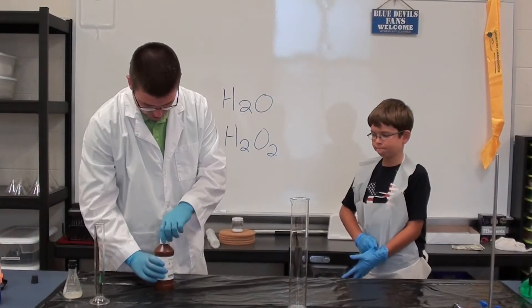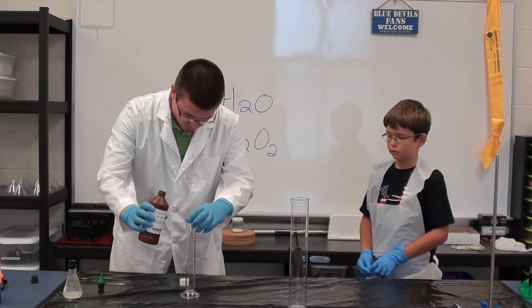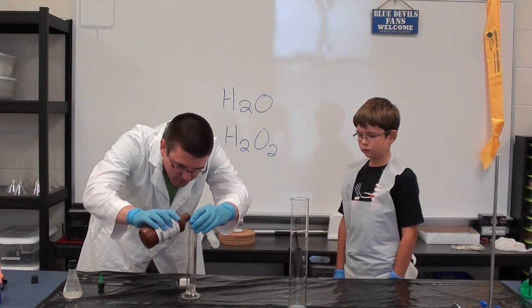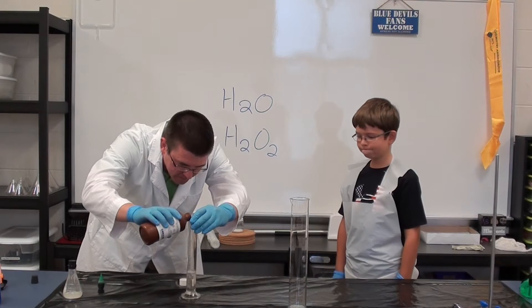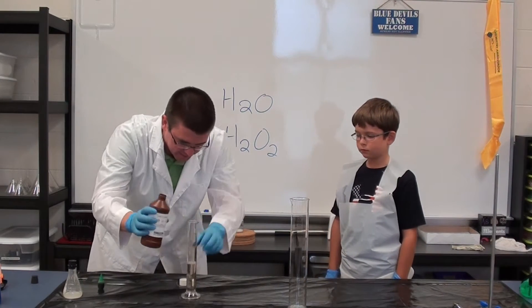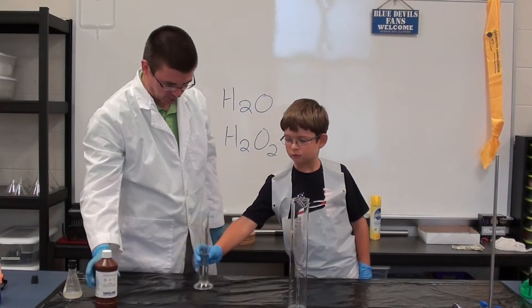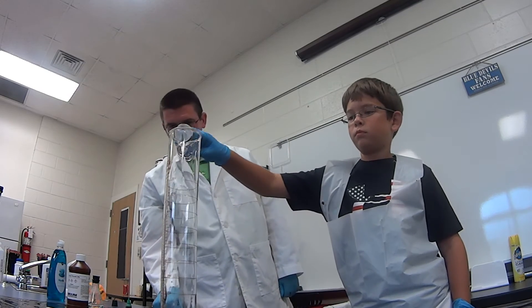So the first thing that we need to do, I'm going to measure this out and let you pour it in. We need about 50 to 60 milliliters of peroxide. Do you ever use hydrogen peroxide at home? A lot of people use it for cuts and scrapes. The kind you'd buy at the store is 3% peroxide. What we have here is 30% peroxide. I'm just going to have you pour that into our big graduated cylinder.